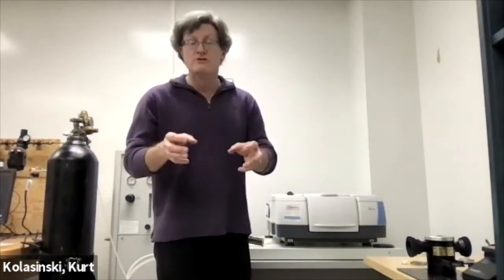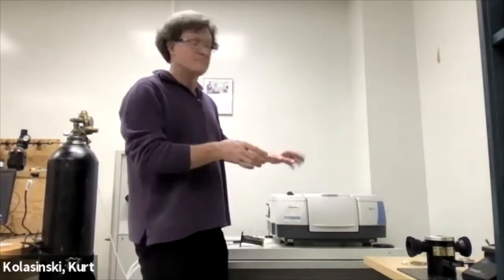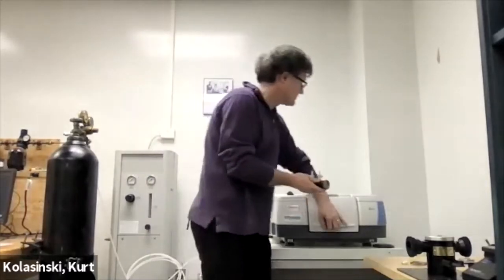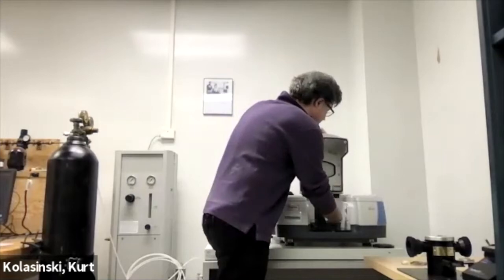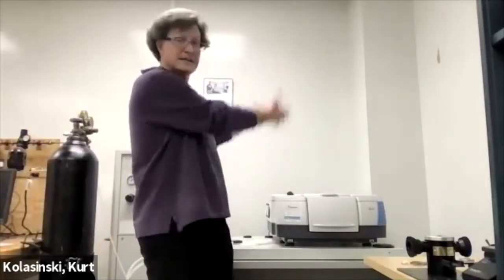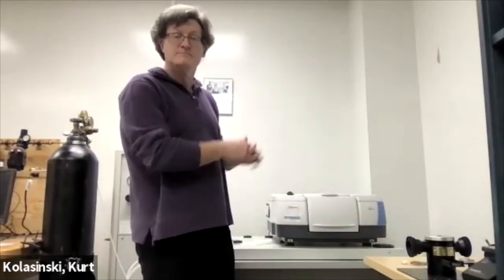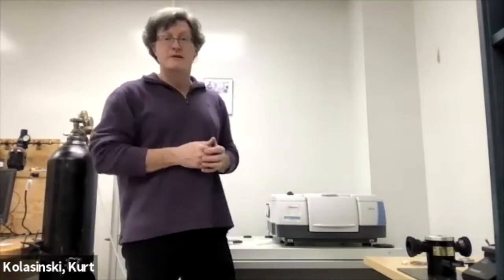For the really good high resolution spectrum, we need the best possible background. So I purged the whole system, right? I put a cell filled with argon into our sample chamber there. I then waited 5 minutes after opening that, because it allows the air in there, and I kept purging it to get rid of water and CO2. And then I took the background.